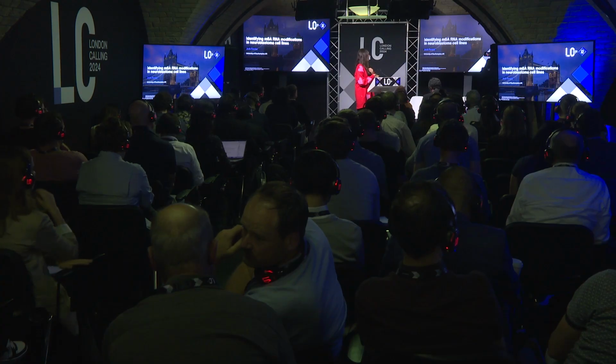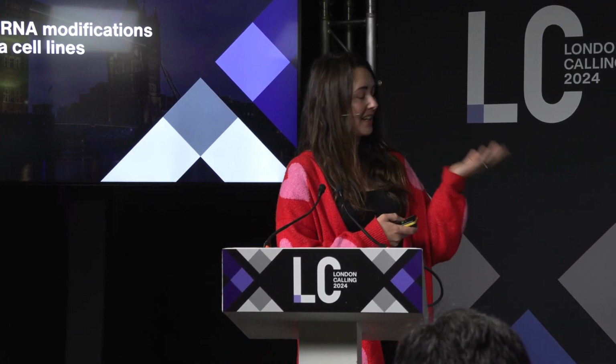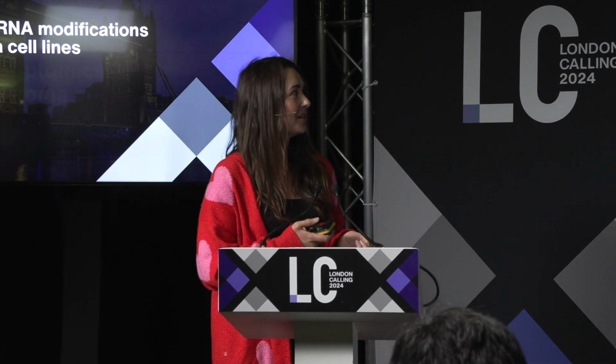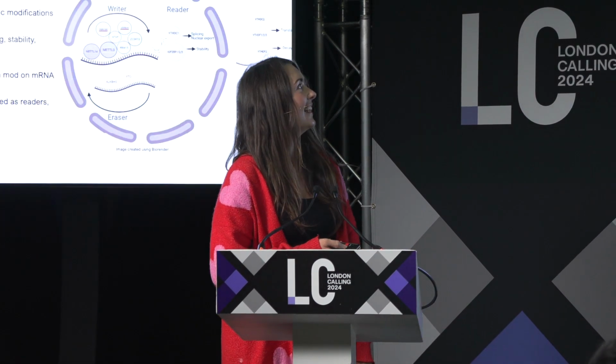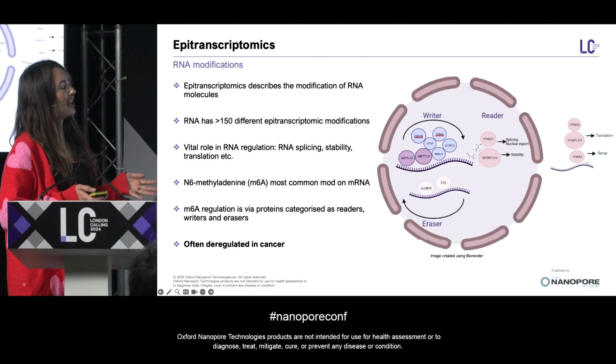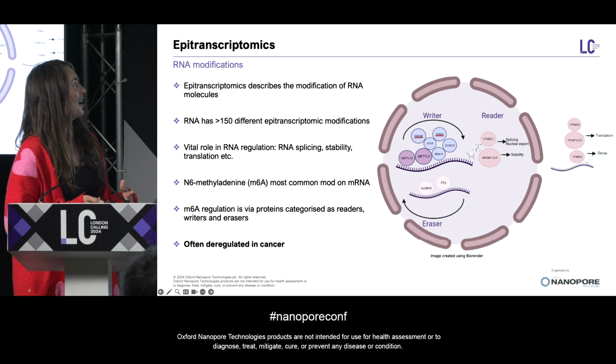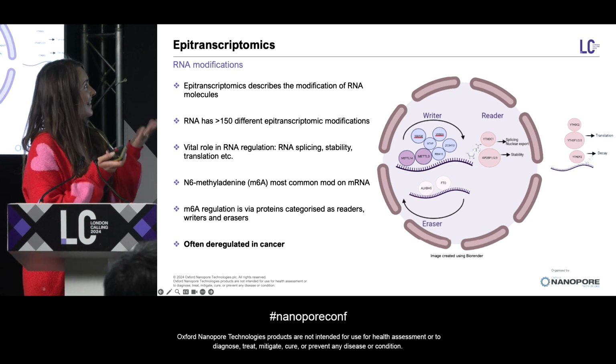I'm going to talk to you today about some of the data we generated looking at m6A mods in neuroblastoma. So just to give you some background on epitranscriptomics, neuroblastoma, and Nanopore. Logan gave really good background to RNA modifications, but epitranscriptomics describes the modification of RNA on transcriptomics.